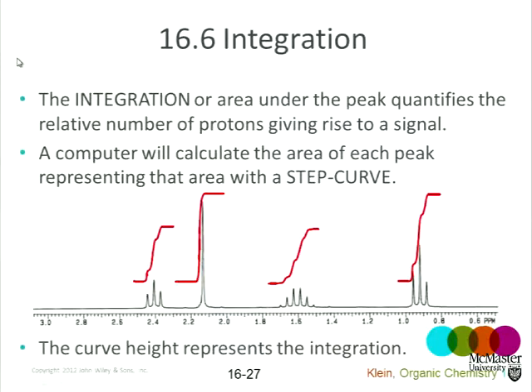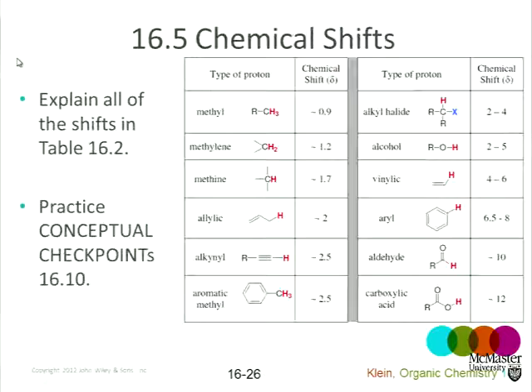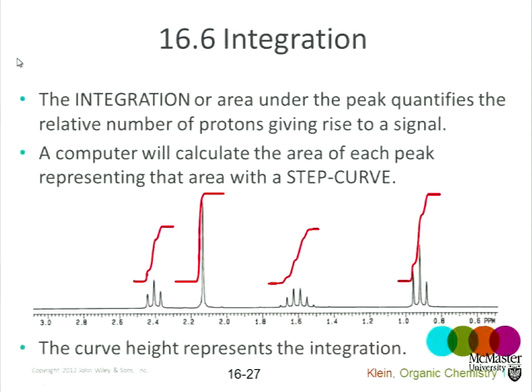All right. So basically, really what you need to do is go away and practice using the chemical shift table to start to determine structures. Don't go too far, though, because coupling is coming next. Integration is relatively simple. Here is a compound with 4 different types of hydrogens plus couplings. Okay, and we'll worry about the couplings on Thursday.